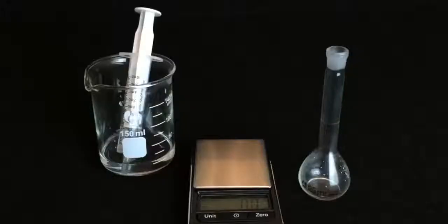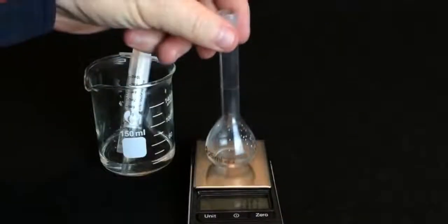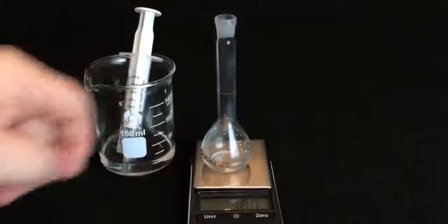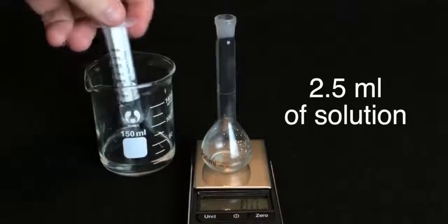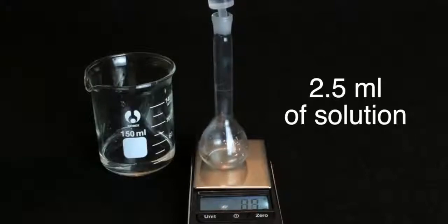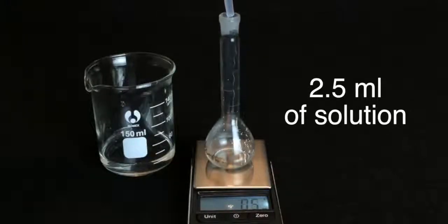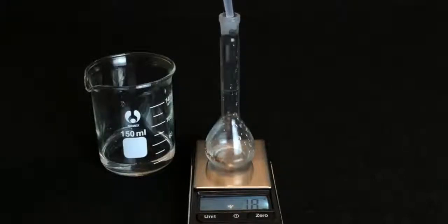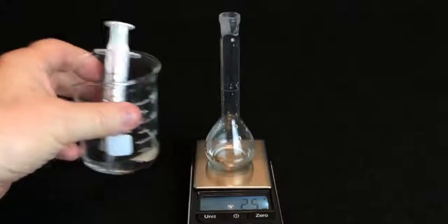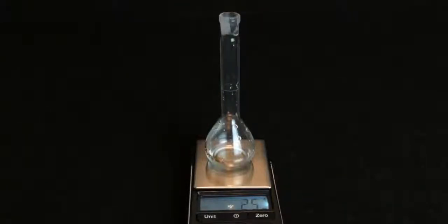you can do the dilution by weight rather than by volume. In that case, place the flask on your digital scale and zero the scale out. Now you need to add precisely 2.5 milliliters of solution. To keep things simple, we're going to assume that the concentration is low enough so that the density of the solution that you are diluting is essentially the same as the density of the solvent that you're diluting it with. Then you just have to add the solution a few drops at a time until your scale reads one-tenth of whatever 25 milliliters of the solution would weigh. That way, you'd have one part of the volume of the flask filled with your solution. Since we're using distilled water, the density of which at room temperature is essentially 1.00 grams per milliliter, we add the solution until the scale reads 2.5 grams.